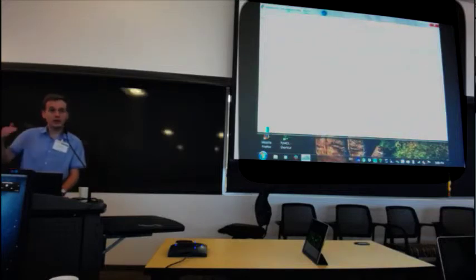During the experiment, we collect the data in runs, and every, let's say, hour, we want to collect a dark frame. So no problem actually putting them in one line, we'll still read it. No, they can't be one line. They have to be different. I'm very sorry. Let's try again. Nothing is finished.